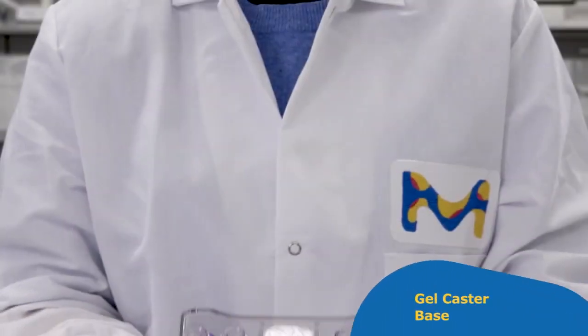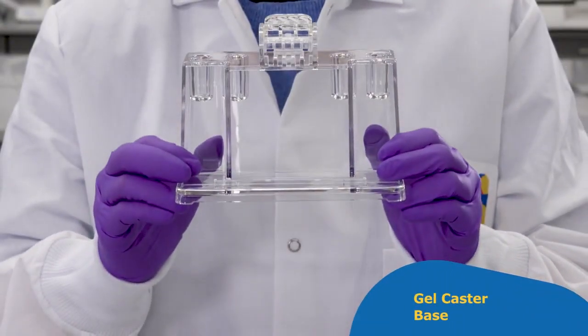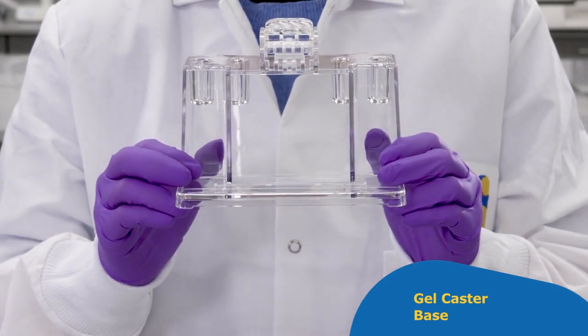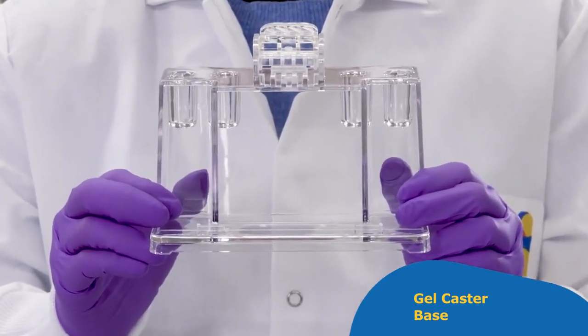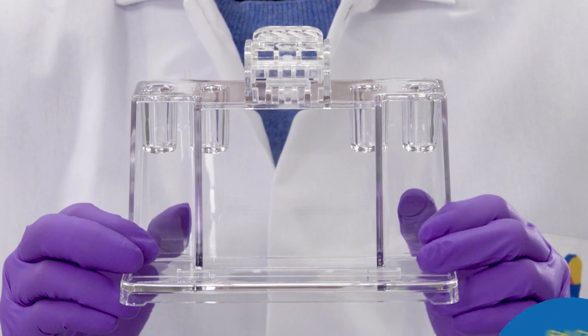The gelcaster base holds the gel casting frame. The tensioned lever at the top securely holds the gel cassette against the sealing gasket to prevent spills and leaks.